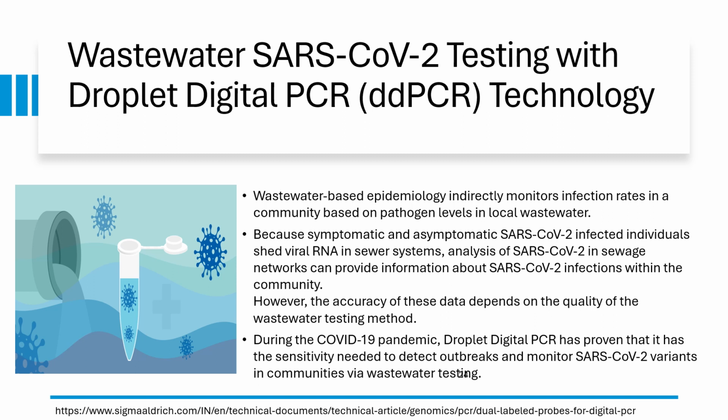However, the accuracy of these data depends on the quality of the wastewater testing method. During the COVID-19 pandemic, droplet digital PCR has proven that it has the sensitivity needed to detect outbreaks and monitor SARS-CoV-2 variants in communities via wastewater testing.